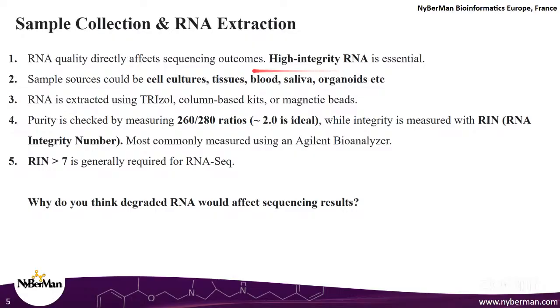Okay, sample sources could be anything, starting from cell cultures, it could be tissues, it could be bodily fluids such as blood, saliva, it could be organoids, etc. Anything from which you can extract RNA could be your sample source.